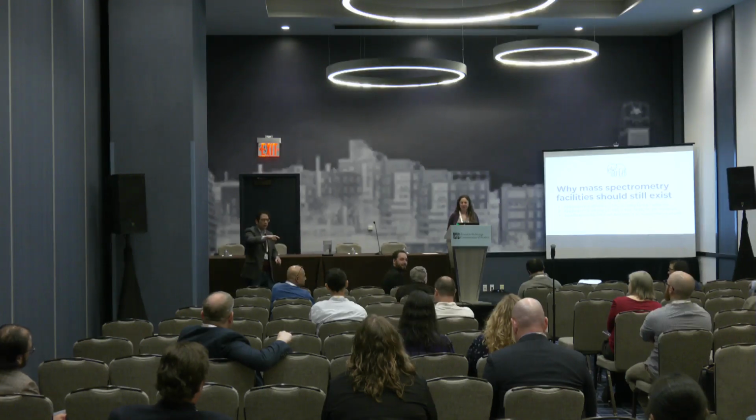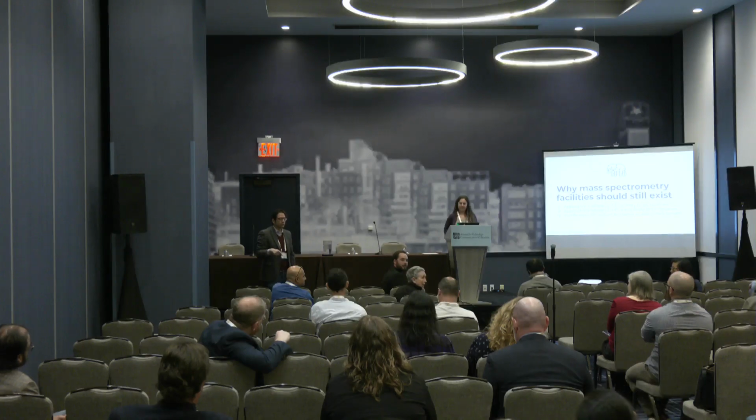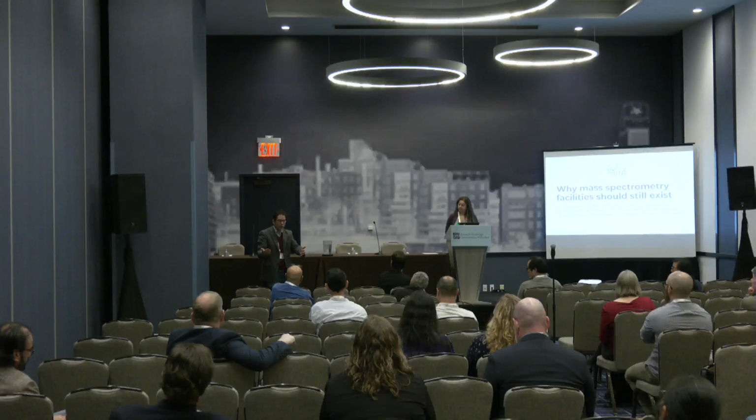What I don't really understand is that, all right, you're either going to send the sample off to the company or the project, but if you want to have it in-house, who can really do that? Because the readout crew is used to doing the genomics, so they do the capturing. So if you have sequencing expertise, then potentially you could do it in-house.